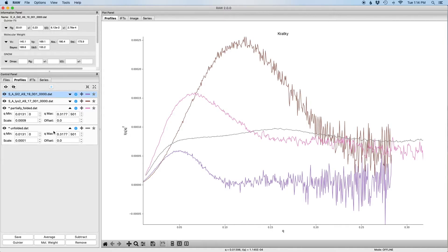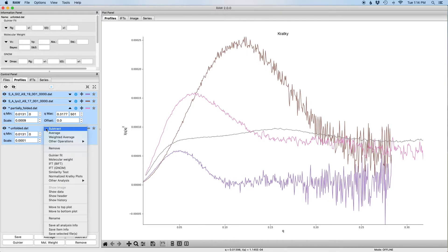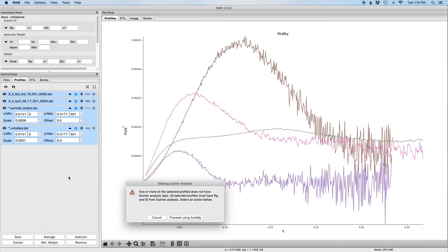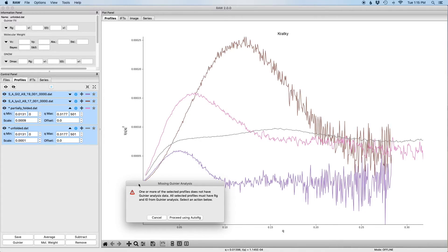It turns out both glucose isomerase and lysozyme are very globular, but because one is larger than the other, they look very different on the Kratky plots. So what we're going to do now is we're going to plot these on what's called a normalized Kratky plot. So I'm going to select all four scattering profiles just by shift clicking. Then I'm going to right-click. I'm going to select normalized Kratky plots.